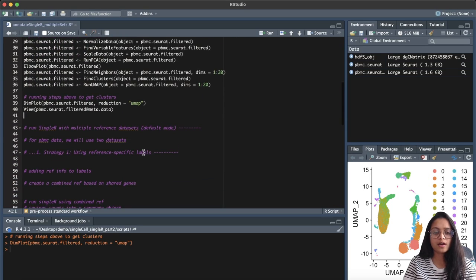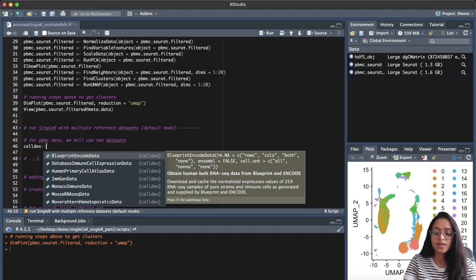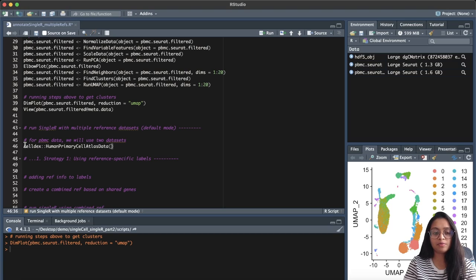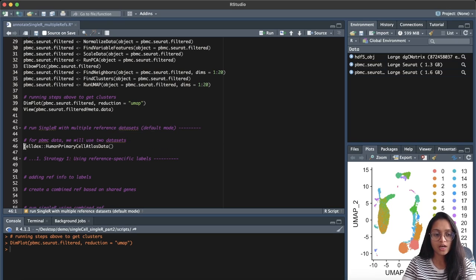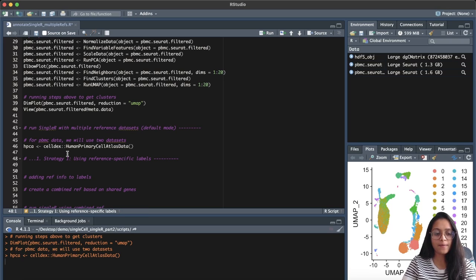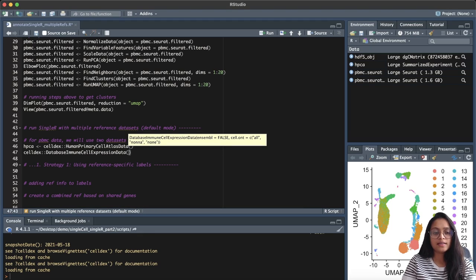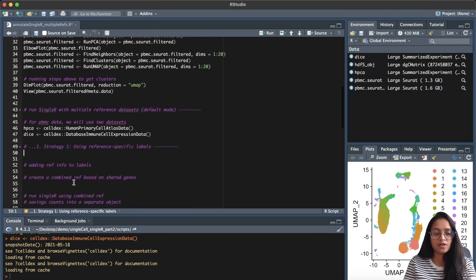Let us start by choosing our reference datasets from the celldex package. The first dataset we will be using is the Human Primary Cell Atlas data, which contains publicly available microarray datasets from human primary cells. Most cell types in this dataset consist of blood subpopulations, but other cell types are also present. We'll store this in a variable called hpca. The next reference dataset is the Database of Immune Cell Expression (DICE) data, which contains bulk RNA sequencing samples of sorted immune cell populations. We save this into a variable called dice.